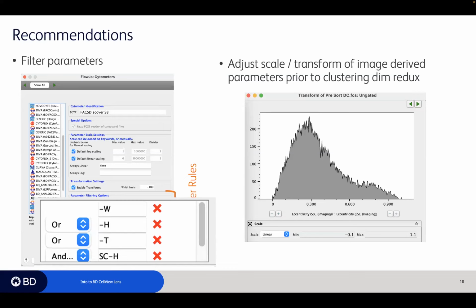You just want to make sure they're visible, because we actually do use the data space. The visible space that you see essentially gets binned up. And what we're looking to do with those algorithms in almost all cases is to find things that are either similar or different and push them together or push them apart.